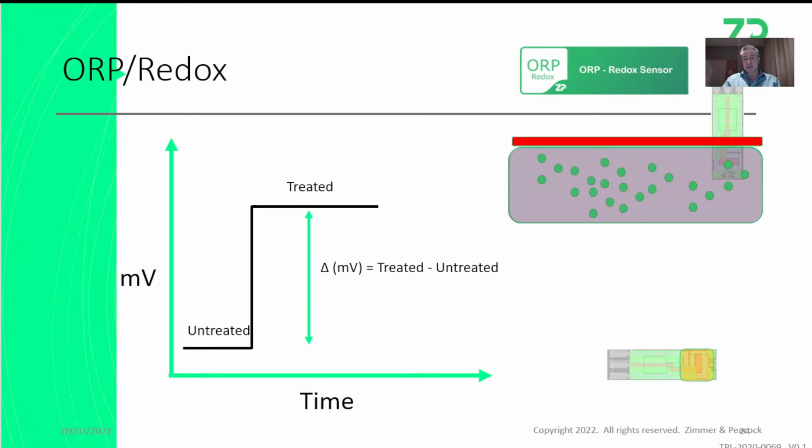But you bring a drop to the electrode. That's the easiest way of doing it. Theoretically, you can actually put the electrode in the solution as well. I would just do that as a second round of experiments rather than my first round. I'd rather just bring drops to the electrodes in the first instance. As I say, I'm here showing the idea of having 3 measurements on 3 electrodes, but in the same experiment, just to try and explain that.